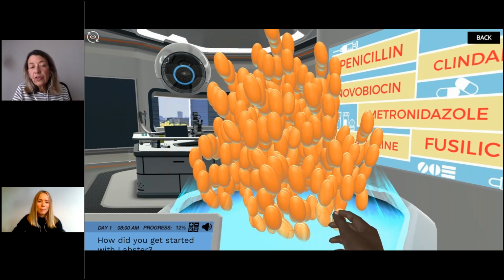We tried different simulations and then chose a number of them, and I will tell you later about them, but it's basically very common microbiology labs: quantification, identification, also a sterilization lab, a fermentation lab, and a lab that was dedicated to sterilization, pasteurization, and so on.